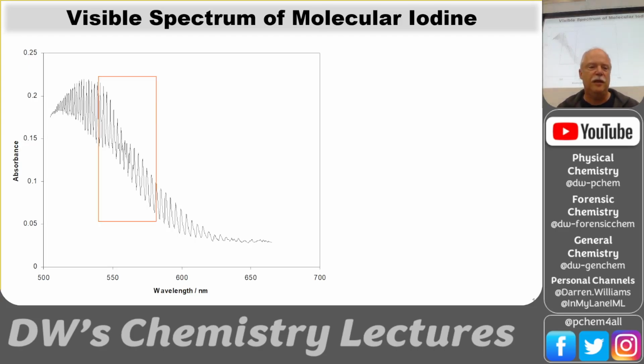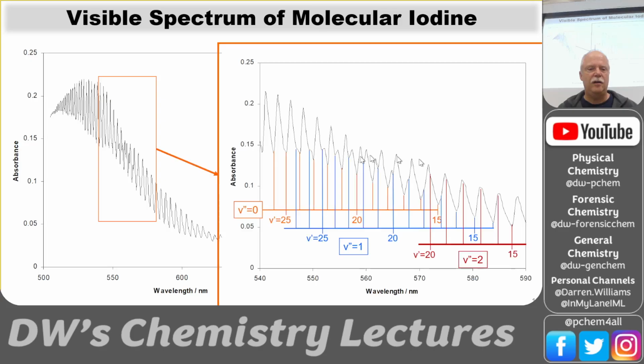You've done worse. Okay. So let's see how this works. It looks like a wavy pattern, and it looks like two waves are mixing right here. You see that? The kind of confused area, that's the key spot that you want to zoom in on. So when we zoom in on that spot, then we get this. And this particular slide in your notes is the key to this lab.